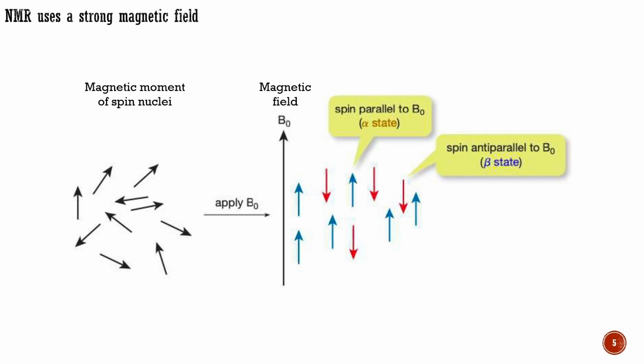Fortunately, things are simpler with an atomic nucleus. Its energy levels are quantized, just like the energy levels of an electron, and it can adopt only certain specific energy levels. The atomic nucleus is like a compass which points, say, only north or south, and nothing in between.